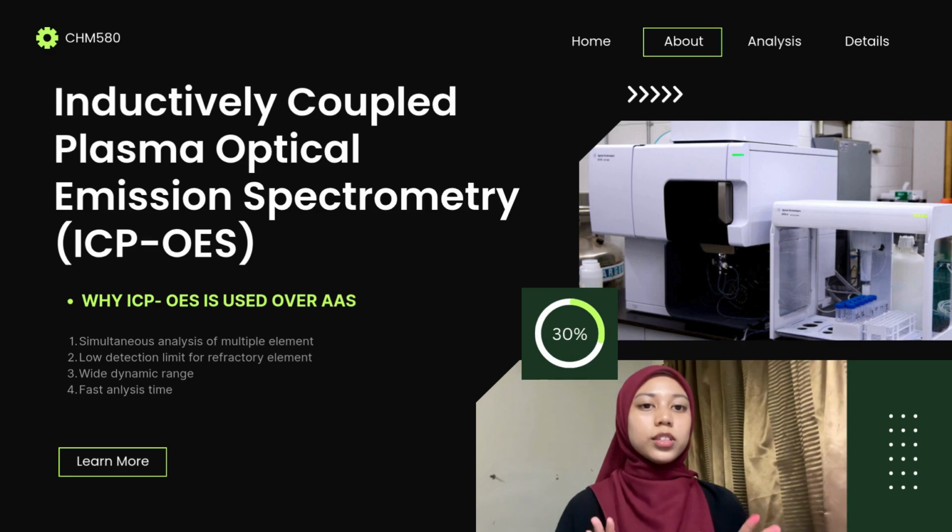Secondly, it has a lower detection limit than AAS, which means it can detect and measure a very small amount of an element in a sample. Thirdly, it also provides a wide dynamic range, which refers to the instrument's ability to accurately measure elements from very low trace levels to very high levels within the same range. Lastly, it also provides a fast analysis time since plasma provides high temperature, thus the atomization becomes faster.